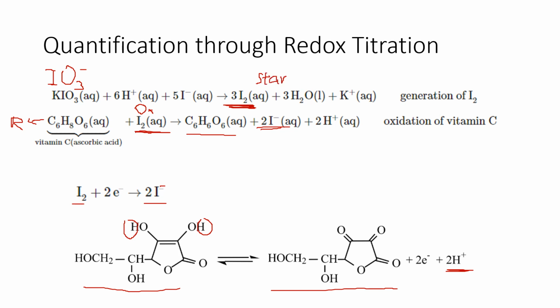At the beginning, while we still have ascorbic acid, the iodine will react with the ascorbic acid. When all the ascorbate is consumed, the iodine will accumulate and start to react with starch. We know from the iodine clock lab that this complex has a very dark blue or black color. In this case, it's going to be a dark black color.